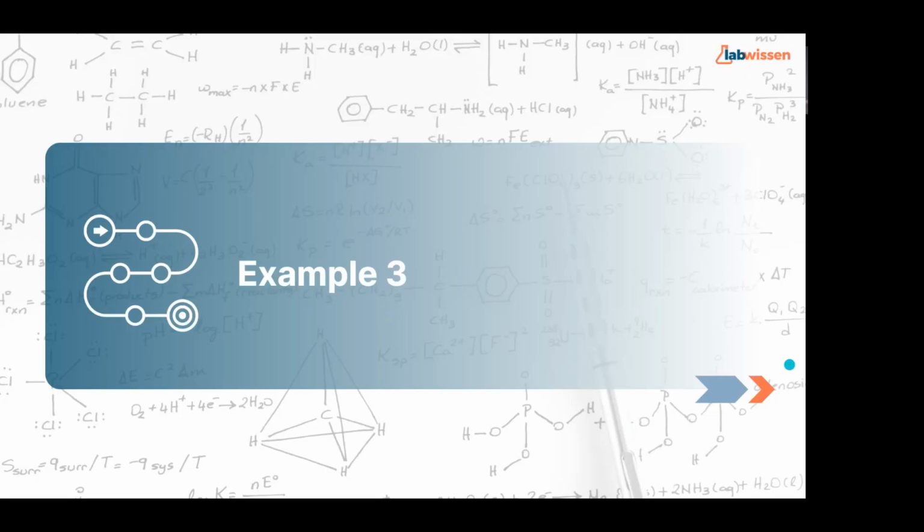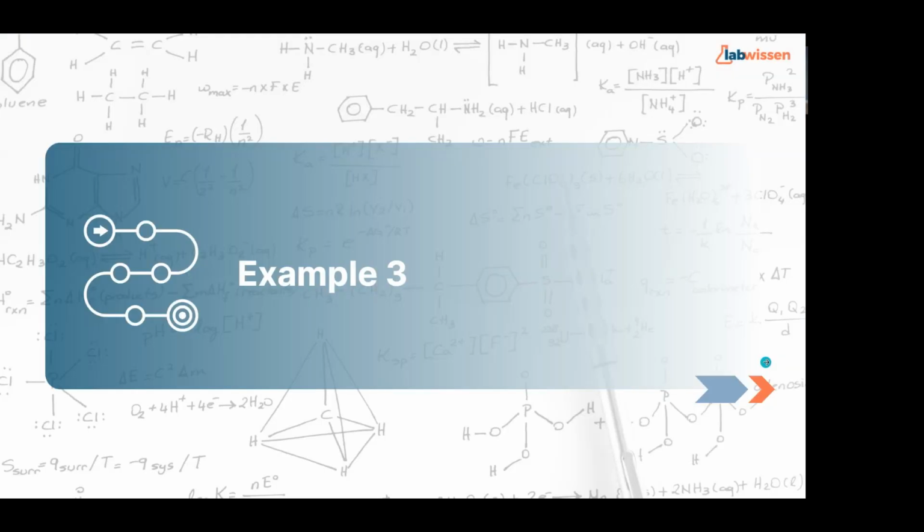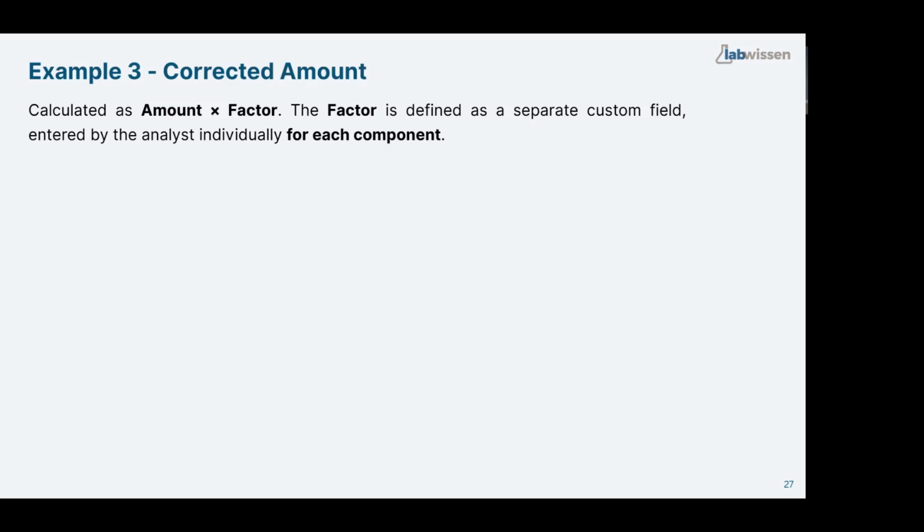So any questions on example 2, creation of drop-down lists? Take a moment to write your questions in the Q&A section. Great. So let's go further to the fourth example. No, third, only third. So example number 3. And now we come to calculations.